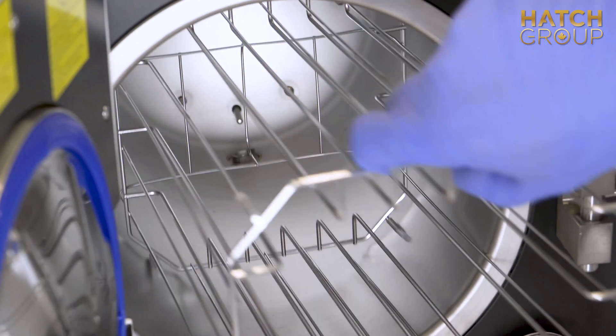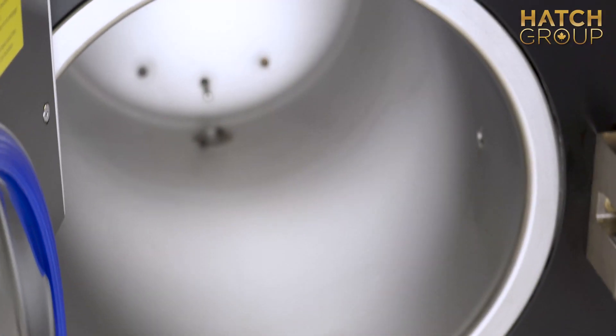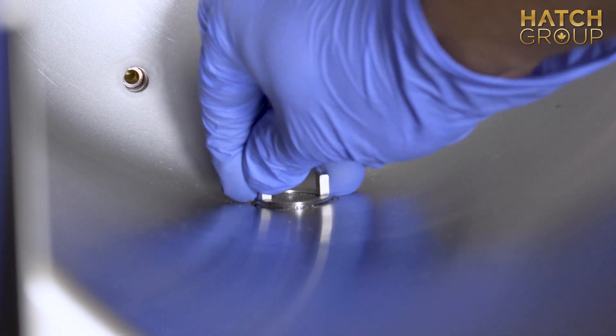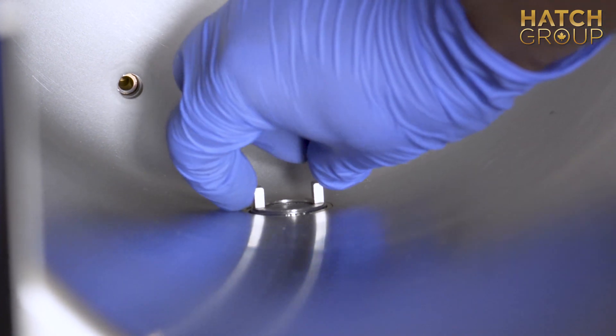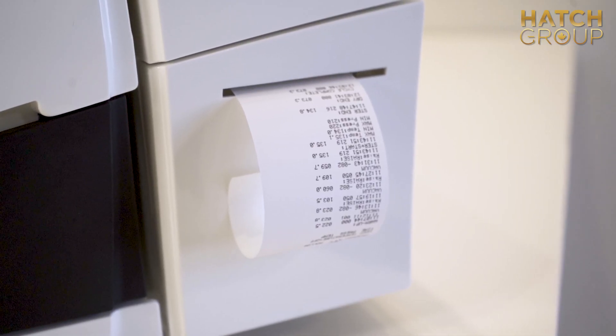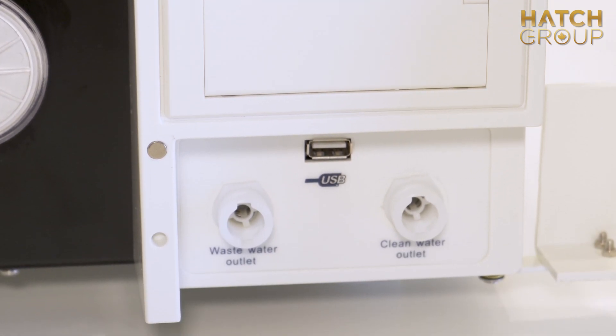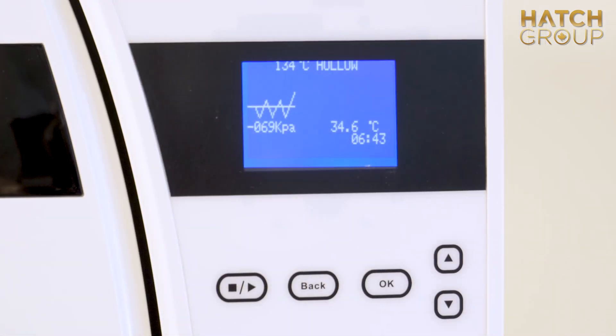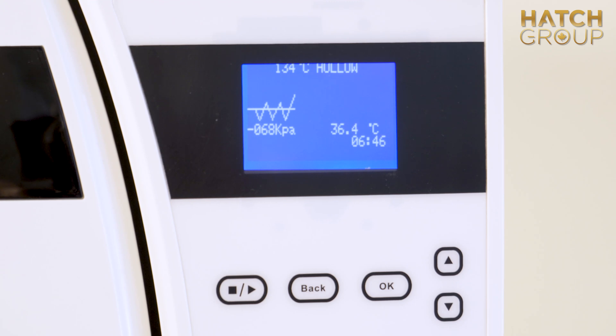All of our autoclaves at Hatch Group are automatic steam sterilizers that run cycles quickly, in as little as 38 minutes, and require minimal service and maintenance. By using the built-in thermal printer and standard USB port, this autoclave will allow you to store or print the historical data from each cycle at your convenience.